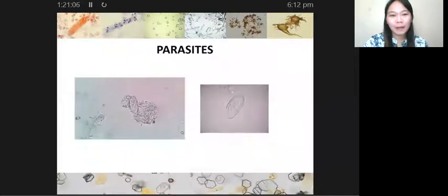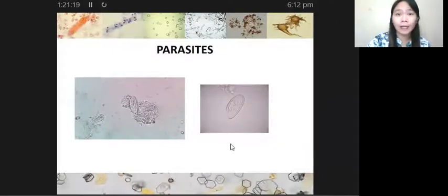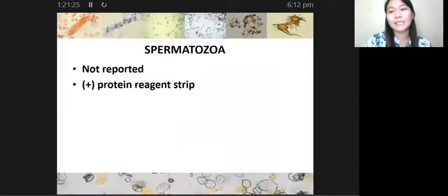So under the microscope, ito naman ang ating Enterobius vermicularis eggs. This is in urine. Siyempre, urine yan, napakalinis naman kung feces or stool sample yan. Okay, last na ito for this video.